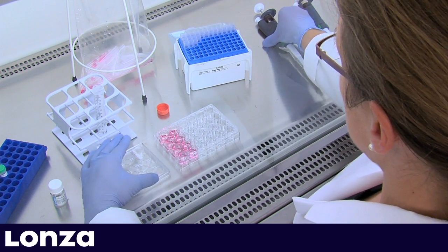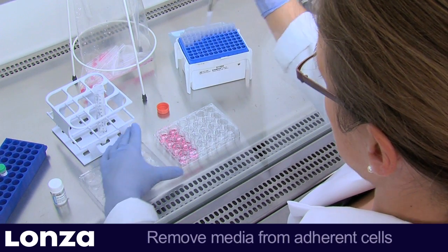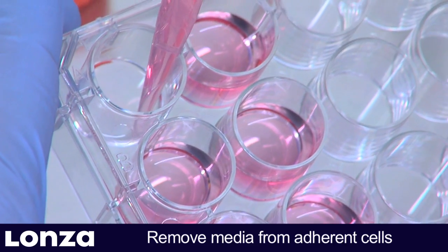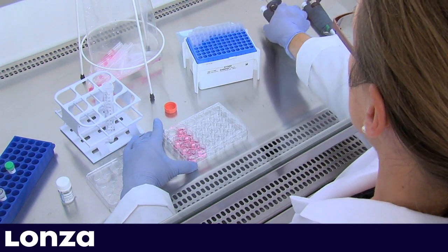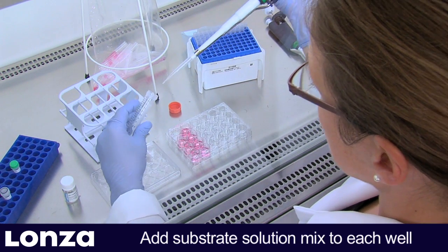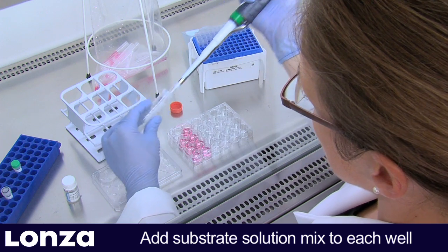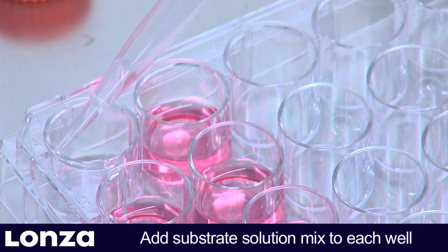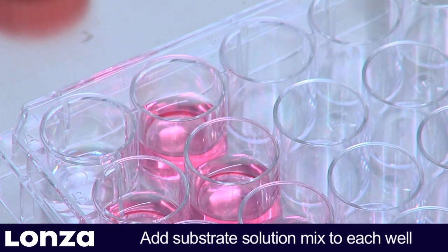Now prepare the cells. While removing media from the adherent cells, be careful to avoid disturbing the monolayer. Then add the substrate solution mix to the well. To avoid leaving cells without liquid coverage, it is recommended to perform media removal and addition of substrate solution mix one well at a time.